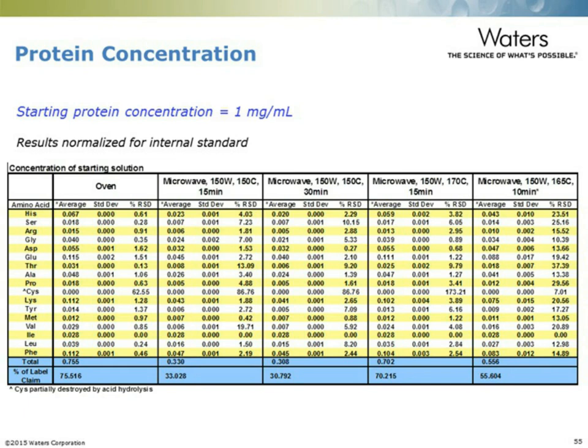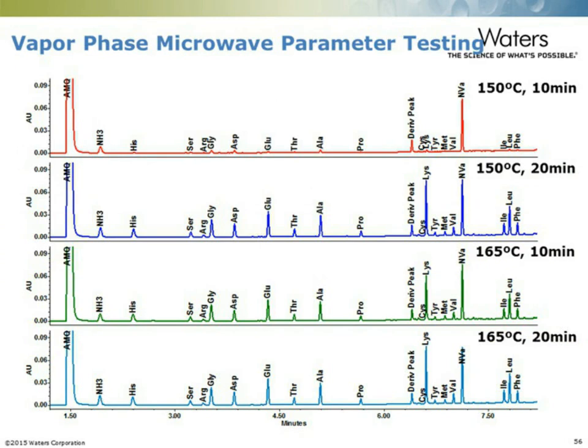The changes in the analytical results do reflect the various time and temperature, as you would expect for any sort of chemical reaction. The proportions don't change very much. The absolute amounts do increase with increases in time and with temperature.